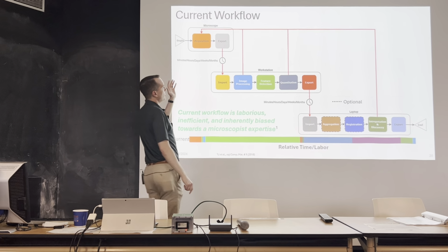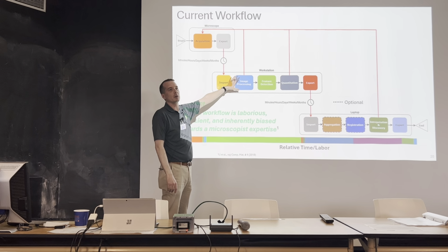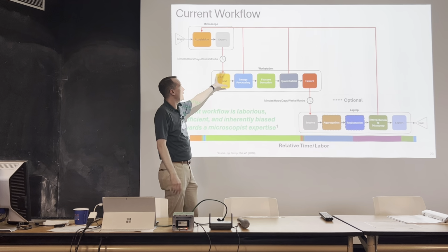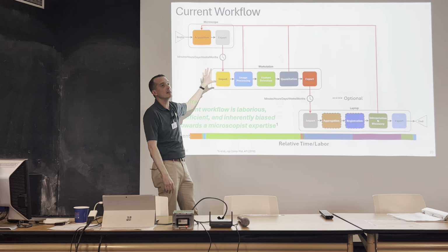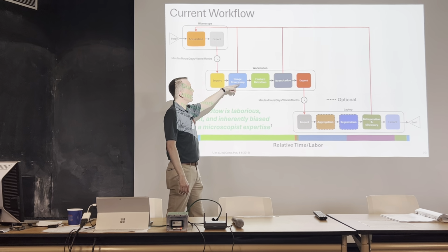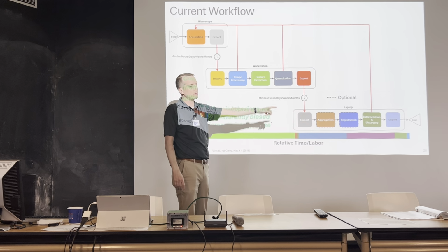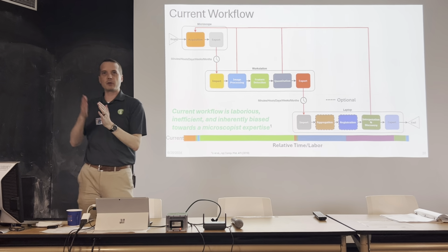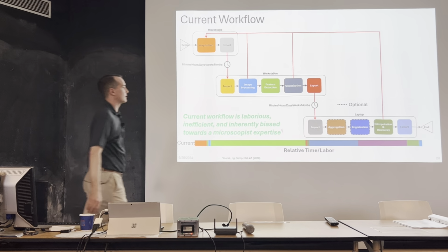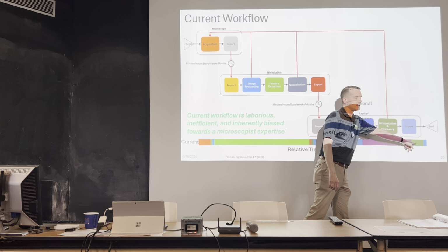Right? So you have to use some other system, and that maybe is the one computer that has the dongle for the software that you need, that you paid the license for back in 2005, and you'll import your data, and that's the one that has the decoder that you need for the proprietary data. You'll run your image processing, you'll do your feature detection, quantitation, you'll then export it to your laptop, and as you're going to the conference, you will put this all together. That's where you'll do your aggregation, and you'll finally do your interpretation and discovery and present it to an audience, correct?